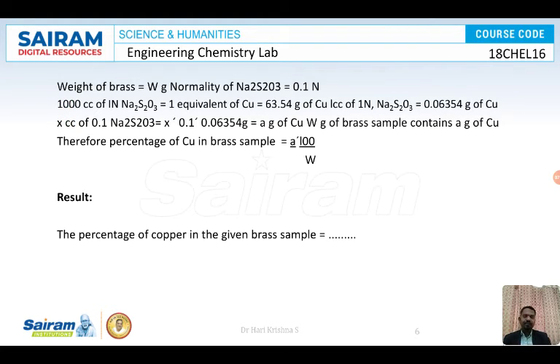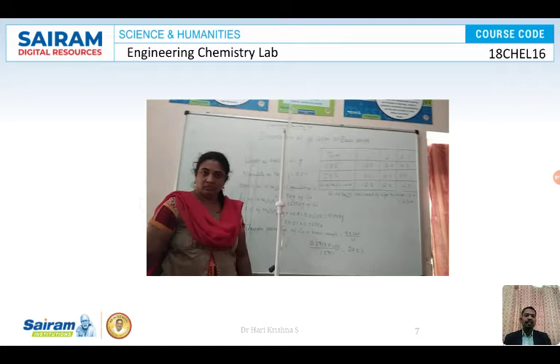X means how much volume is consumed, the titration value, right? X cc of 0.1 normal sodium thiosulfate is equal to X into 0.1 into 0.06354. Let us call it A grams. Therefore, percentage of copper in brass is A into 100 divided by W, where W is the weight of the brass sample taken. This is how we are going to calculate the percentage of copper present in the given sample.